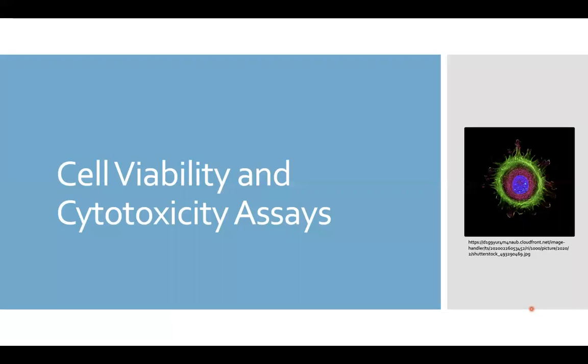Now I will review 4 cell viability and cytotoxicity assays. These assays are performed because it is important to know how the chosen antioxidant affects the cells and how toxic the supplement is to cell health.